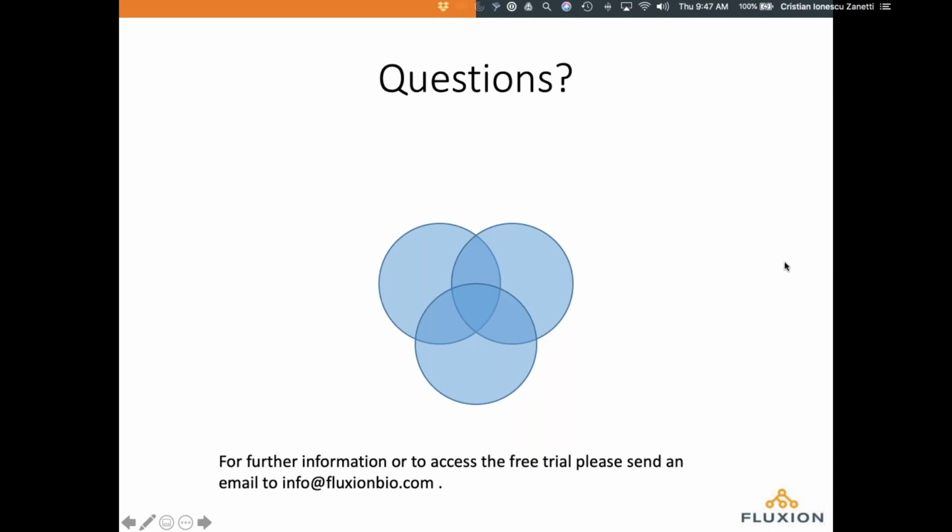If we have all the data, it takes us about a couple of weeks to develop and validate the background model.